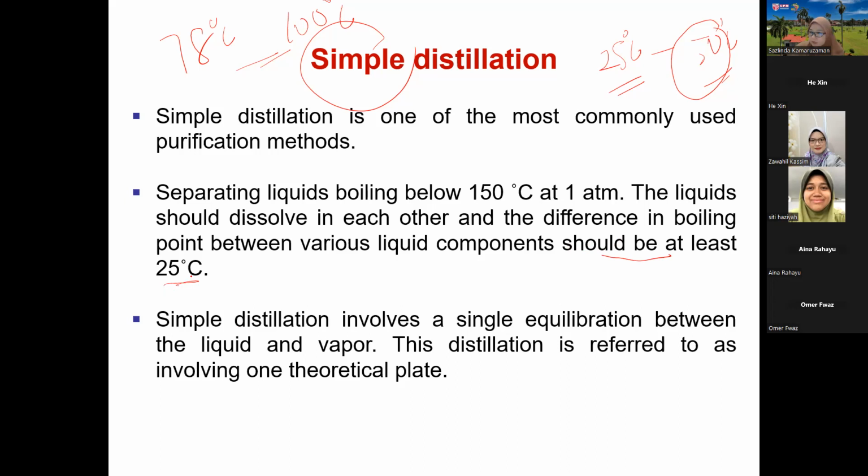Another important piece of information is that simple distillation involves a single equilibration between liquid and vapor. This is the one that we already discussed: we have a liquid and it forms a vapor. This distillation is referred to as involving one theoretical plate.